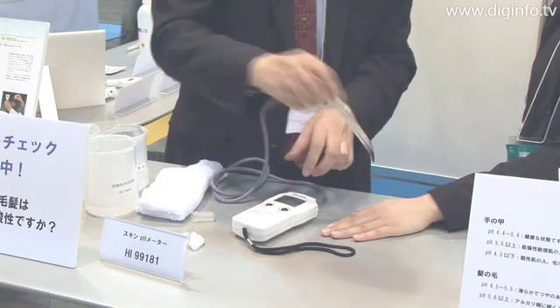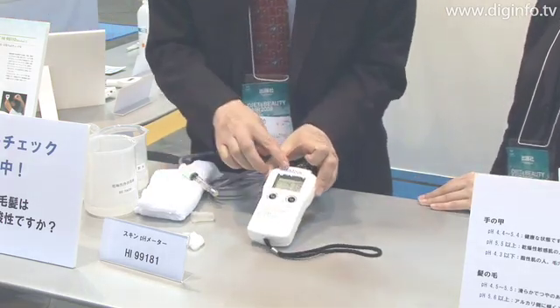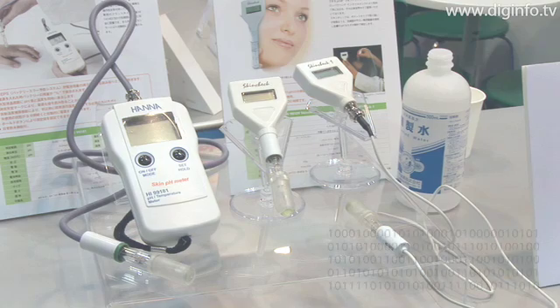Antiseptic and cleaning fluids offer good hygiene measures. Sales agencies import and market this product for the beauty, cosmetics, hair care, and medical industries.